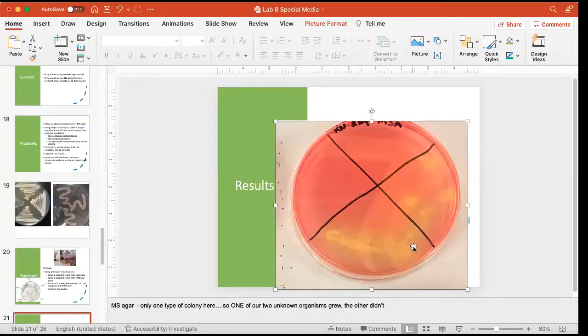If it were, what I would see on that plate were a bunch of colonies. Some colonies would be growing on yellow media, and some would be growing on pink media. The Staph aureus would have turned the media yellow, and the Staph epidermidis would have left it pink. I don't see that. All of the growth on that plate has turned the media yellow. Let's look again. There are no colonies on this plate that have left the media pink. They've all turned it yellow. So no, my second bug cannot be Staph epidermidis. It just can't be. It's got to be one of the others.